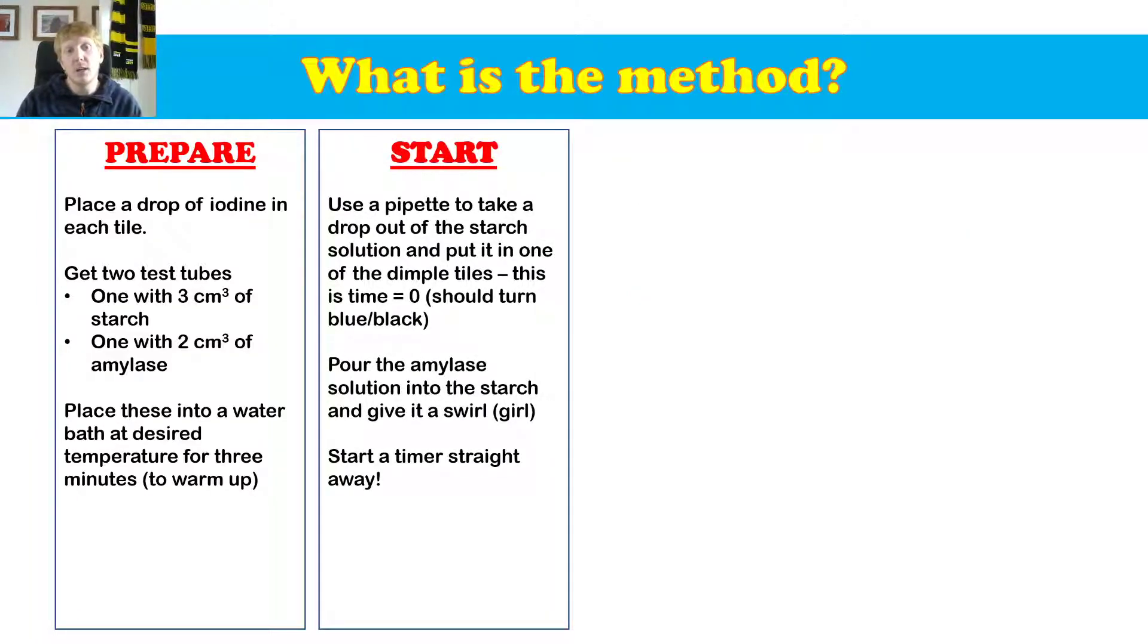Next, so we're going to start. We're going to use a pipette to take a drop out of the starch solution before we've added anything to it, and pop it on that first tile. This is time zero, and you would expect it to turn blue-black.